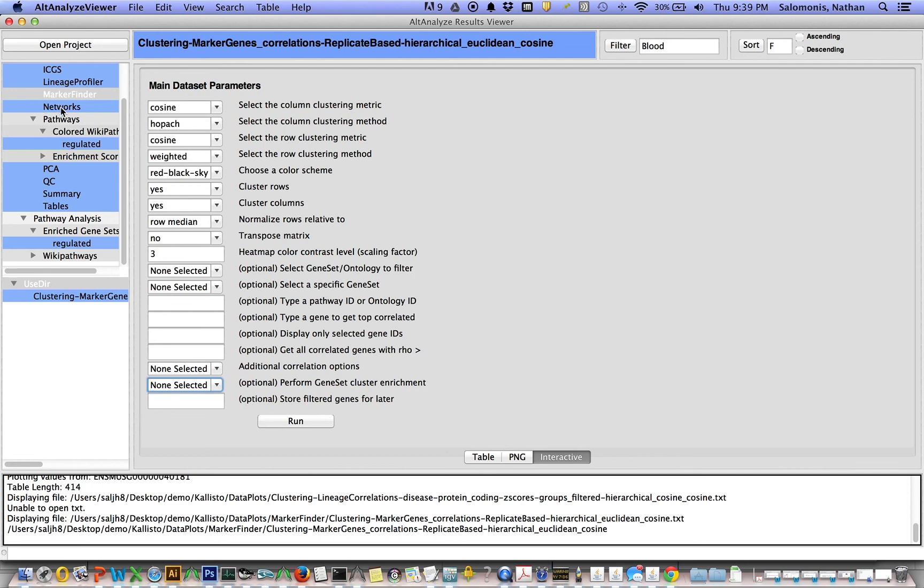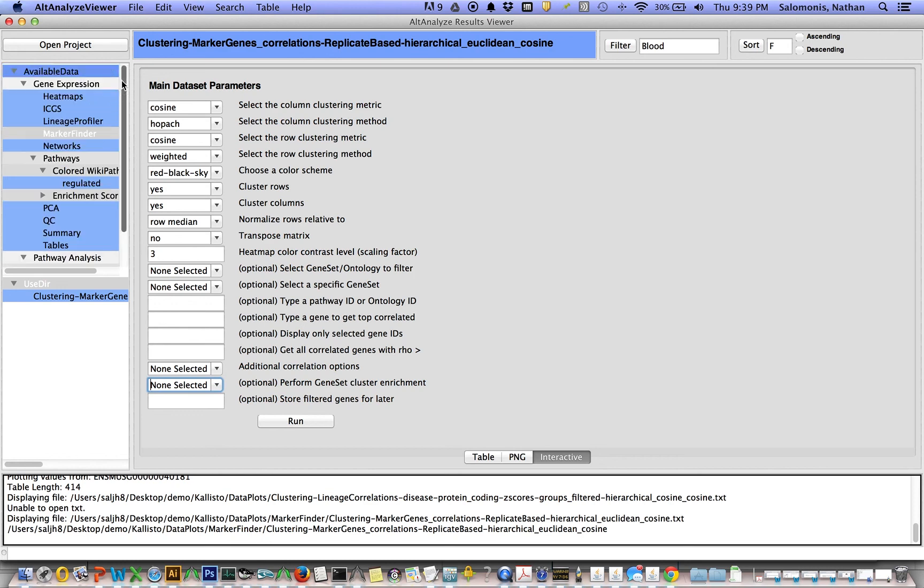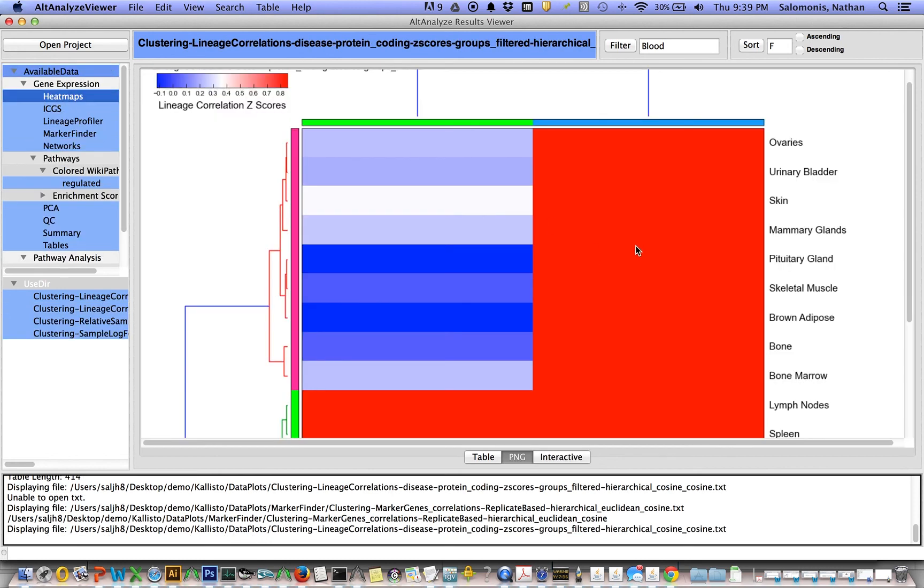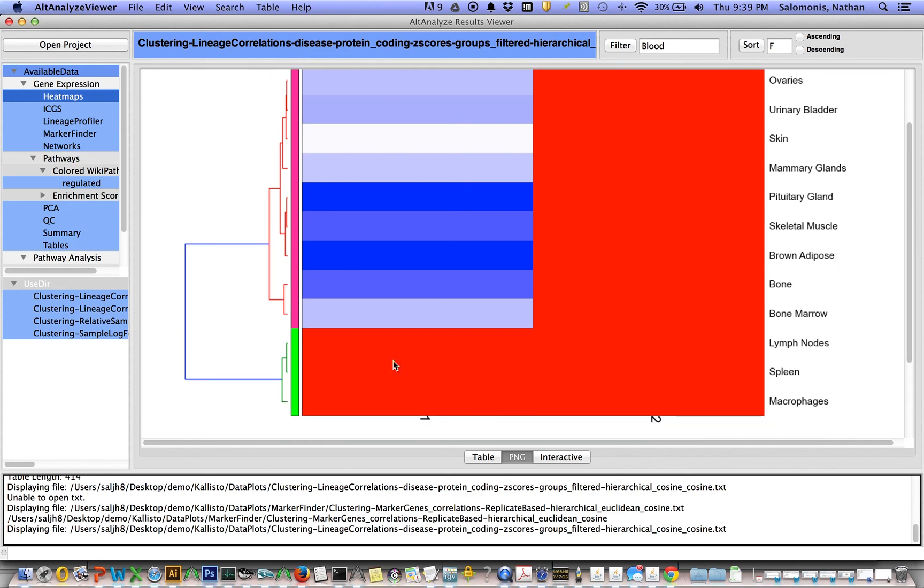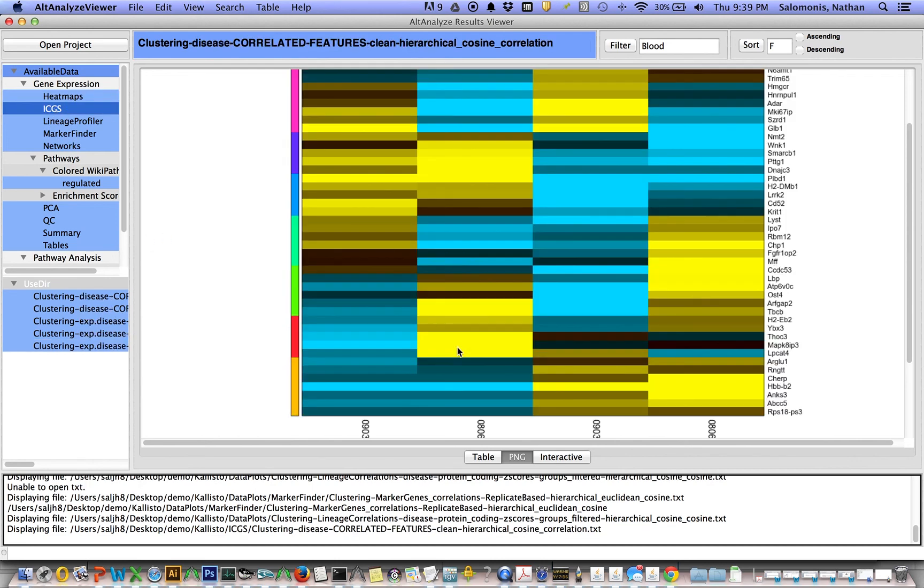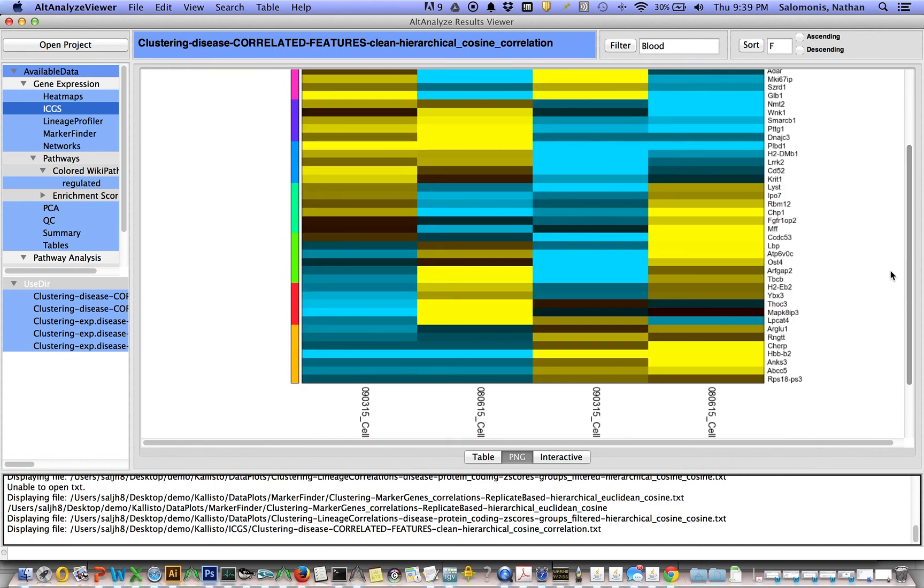We can even do pathway enrichment analyses on the heat map itself. There are other heat maps we can visualize here. If we go under heat maps, by default looks at these predicted cell types that come out of this algorithm lineage profiler. And we can look at our ICGS cluster results. And that's a brief summary of the AltAnalyze result viewer and how to analyze Kallisto results derived from FASTQ files. Let us know if you have any questions or comments. Thank you.